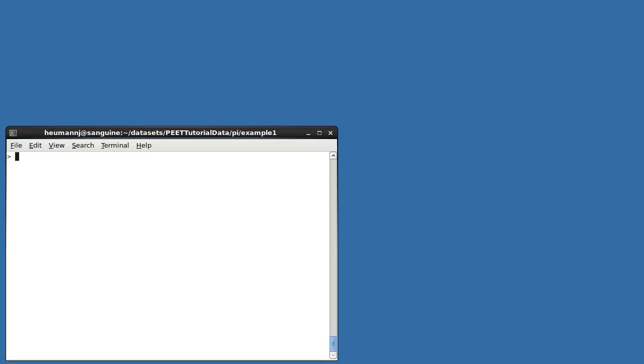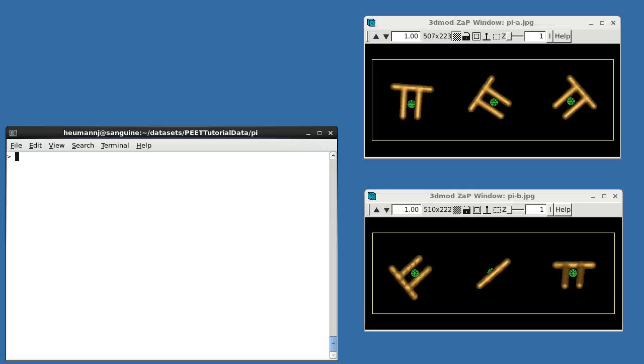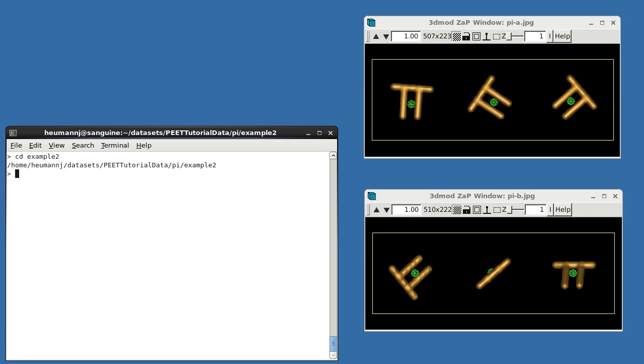Often, when starting an alignment, estimates may be available for the orientations and, perhaps translations, required to align the particles. Let's look at how such information can be used to do a quicker and potentially more accurate alignment. In the present dataset, the leftmost particle in the upper volume is the reference. You can see that a roughly 60-degree clockwise rotation around the tomogram z-axis would be required to align the second particle with the reference, and an approximately 45-degree counterclockwise rotation for the third particle.